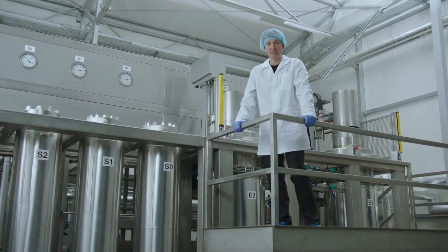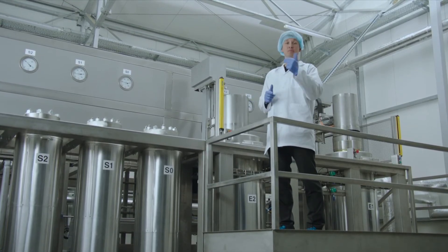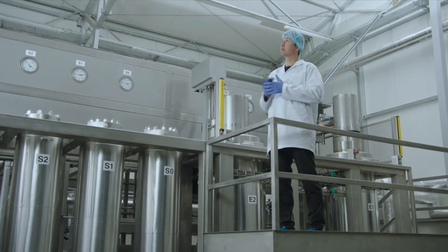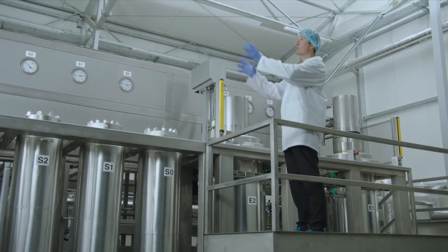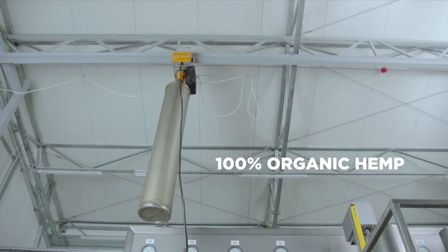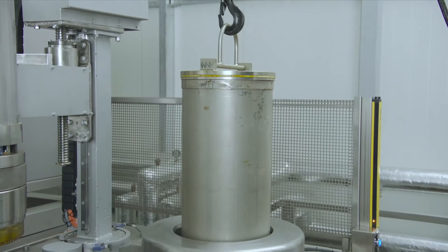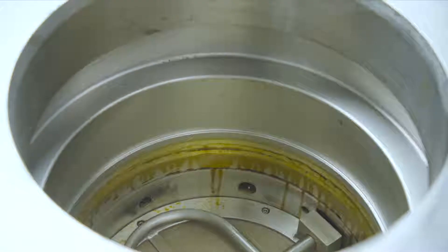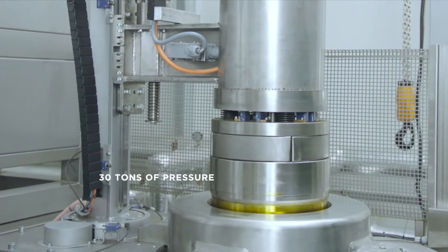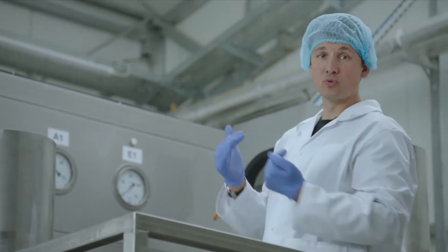So finally we're in the factory — this is the most important part of the whole process. Let me walk you through step by step to explain what exactly is going on here. First we have the hemp which is loaded into the baskets, comes in here, goes down into the tube. This is a high-pressure vessel here, so we seal it and make sure that it's very tight.